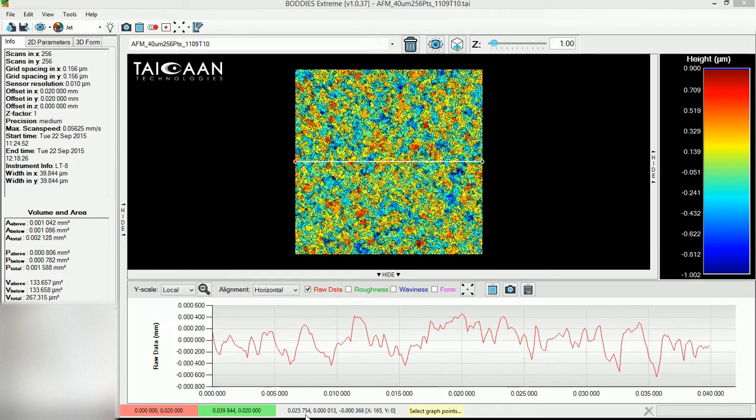I just want to focus on the box I'm pointing to in the lower part of the screen here. These are X, Y and Z positions, and X and Y data points in the three-dimensional space. If I move the crosshair up, and you look towards the lower box, as I move the crosshair you can see those values change. So this is a way of getting basic information about the surface by using the dimensional information provided by moving the cursor.